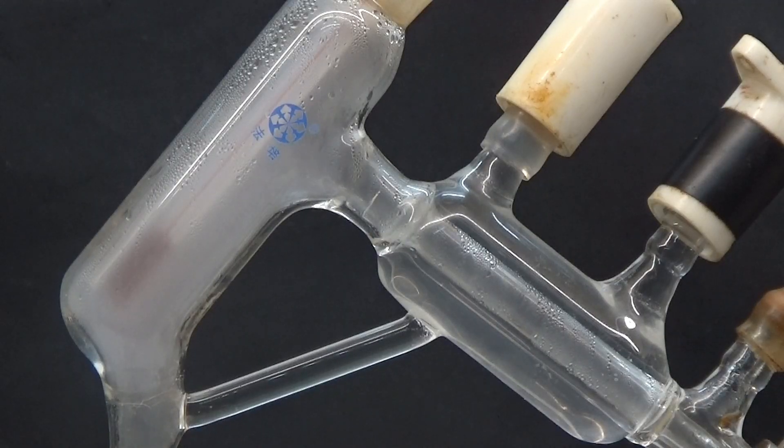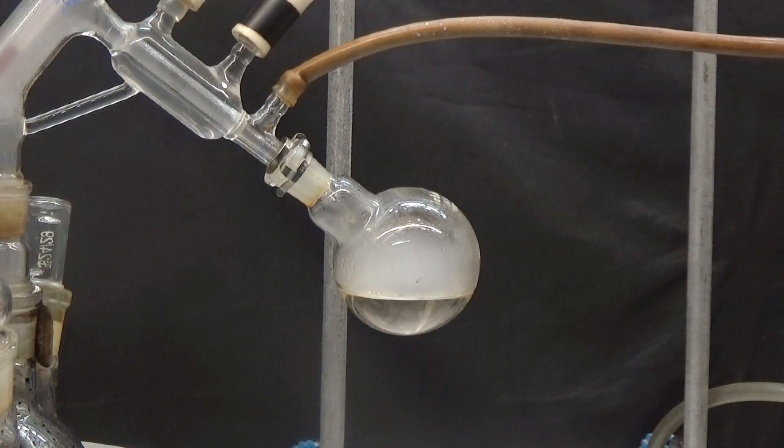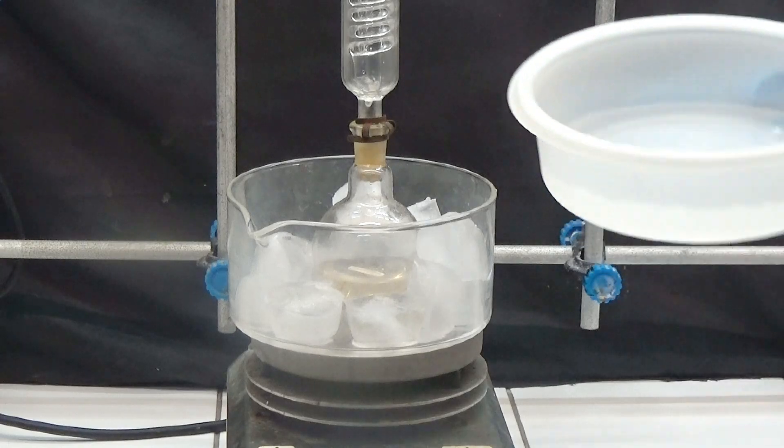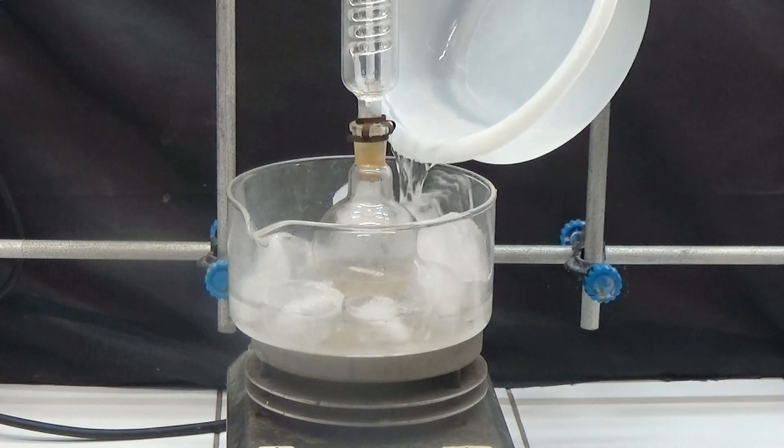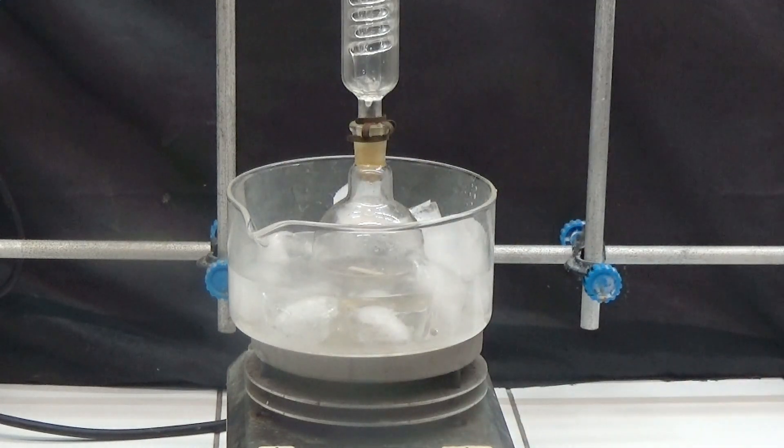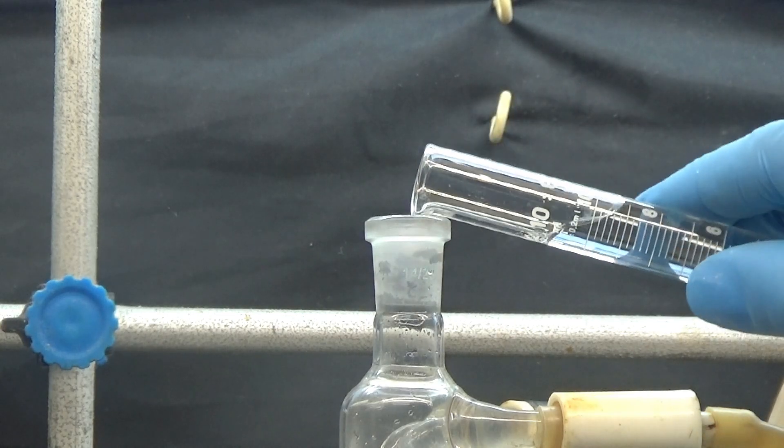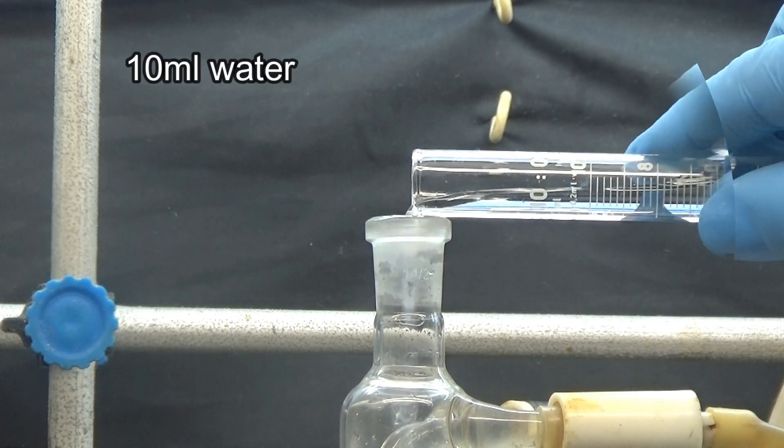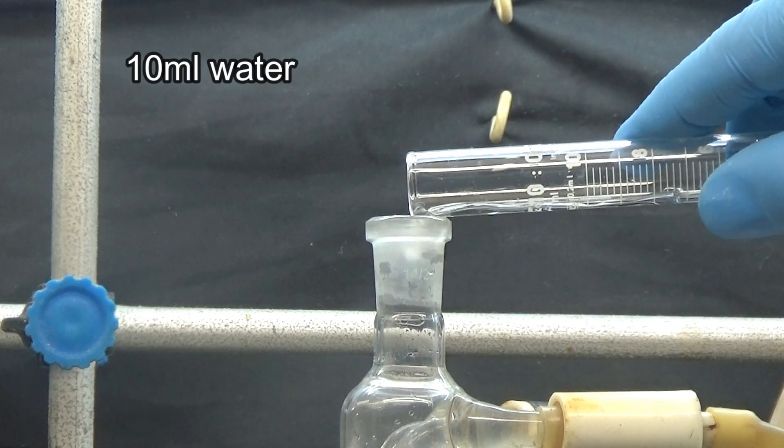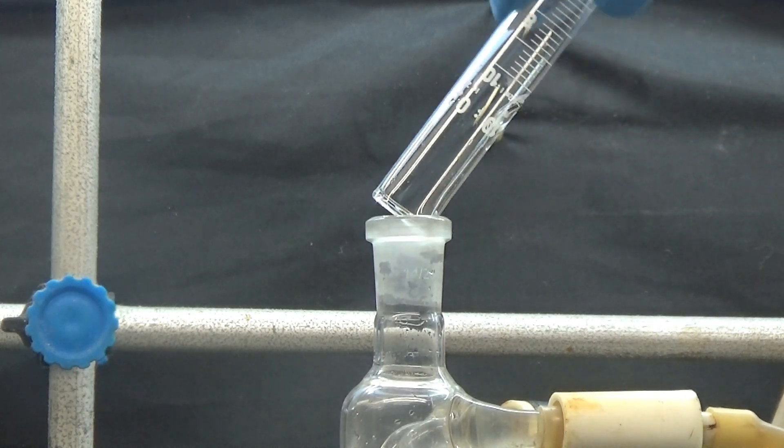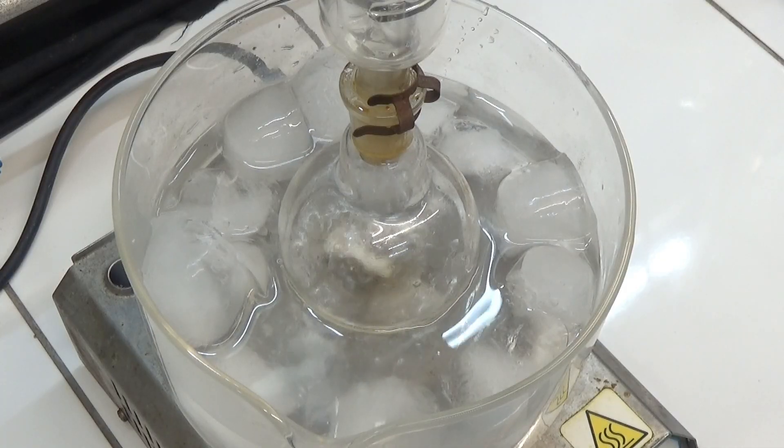When white fumes appear, stop the distillation process. The 100 milliliters flask is connected to a reflux condenser and immersed in an ice water bath. Add 10 milliliters of water to the condenser. Continue stirring for 30 minutes.